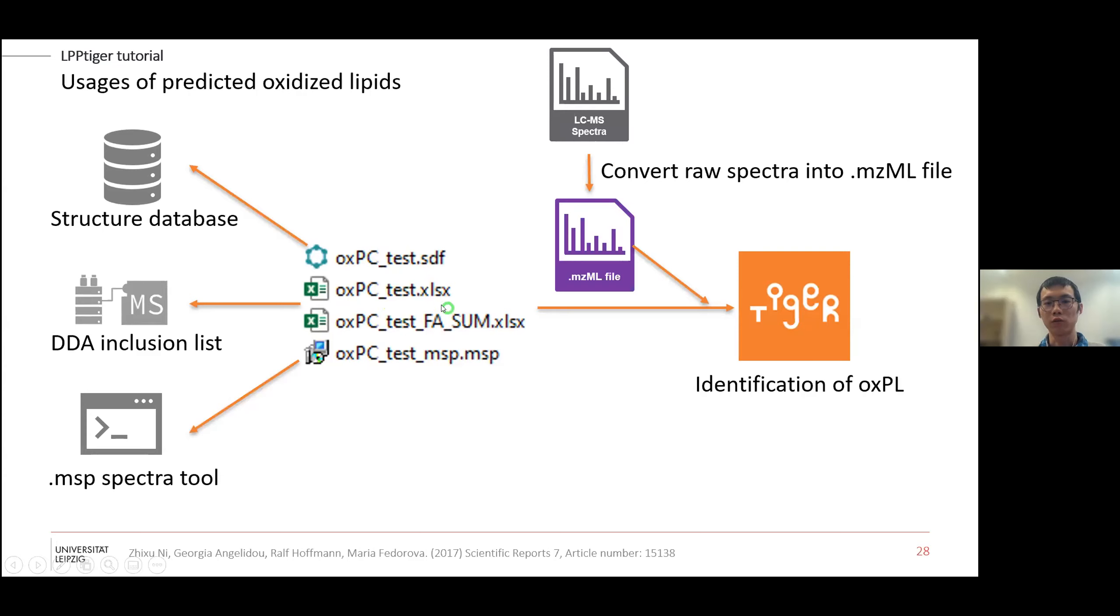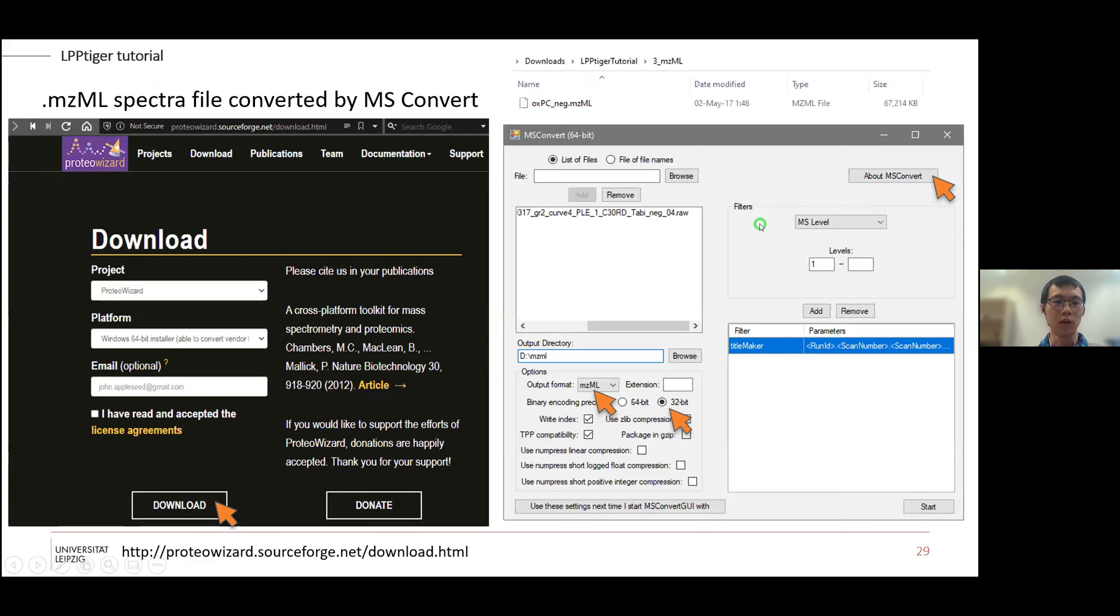Then use the identification function from LPP Tiger. LPP Tiger is designed for identification, that's why we are not able to do quantification here, but there are plenty of quantification software which you heard from previous talks. The MZML format is a common vendor-free format. You download this ProteoWizard software from the website. You select MZML and 32-bit format and then click convert. We provide you a sample MZML file in the tutorial folder.